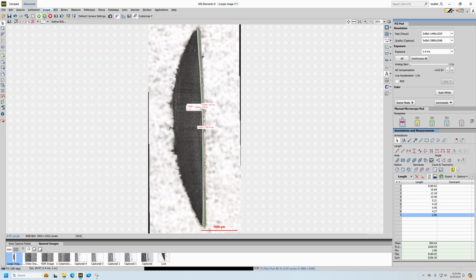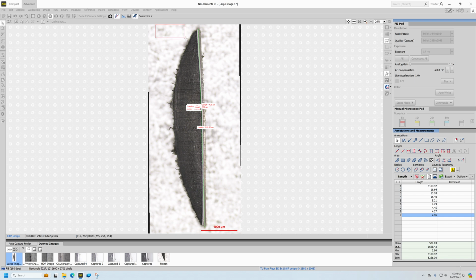One thing you can also do is go to image and then crop, if you want to get rid of some of this stepping that can sometimes occur. You can left click crop and then left click, hold and drag around your image like so. Then you get the edges set. This window pops up. You can say OK, or you can type in different parameters for where you want your crop. You can also hover over any of the edges and reposition them. And then when you're ready, you can say OK.